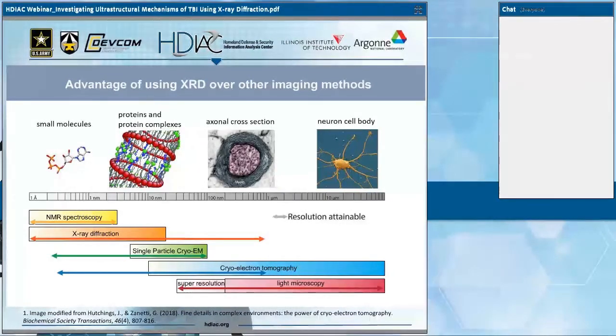Now, one of the great things that Jason mentioned about X-ray diffraction, as opposed to single crystal crystallography or a variety of other very important characterizing techniques that we make use of in life sciences and structural biology in general, is that it has the ability to access a very broad length scale all at once, from the angstrom all the way through to the micron level, potentially even on the same X-ray diffraction picture. And then you can bootstrap, if you like, a little bit further to get even higher or lower resolution domains through combining the techniques multimodally, or through something that we did later on in the study, which we called X-ray diffraction scanning.